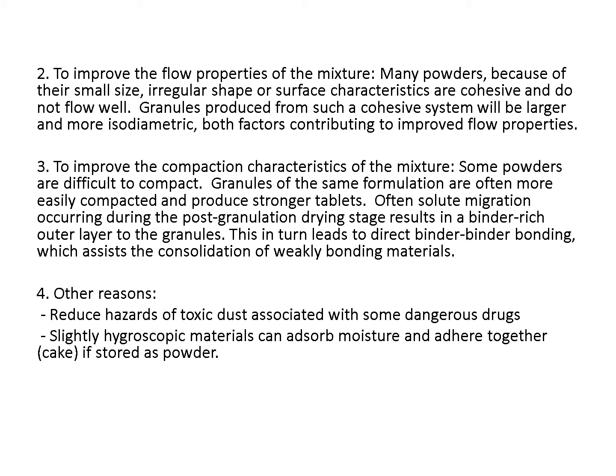So by transforming these hygroscopic fine powders into granules, that will reduce the surface area of these materials, and the tendency of forming a layer of water is less, and the tendency of forming hard cake is less. This is important for preserving the dry powder, because we have to store it in a dry place.